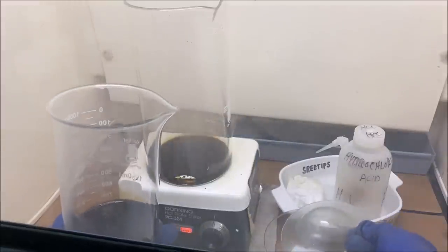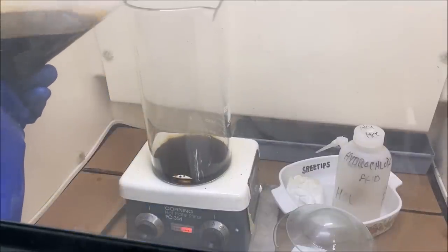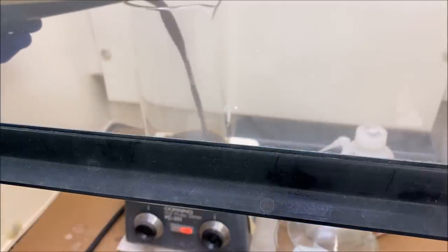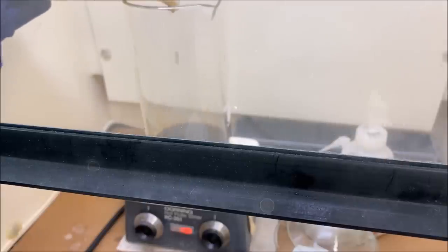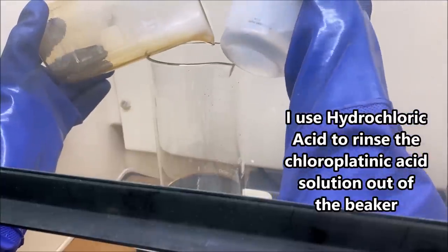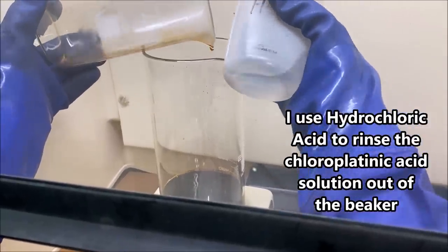What I'm gonna do, this is the platinum solution that I've been pouring off to get it out of the way so I can add fresh reagents to the metal. I'm pouring this back into the main beaker now. The fume hood sash out of the way there. I'm pouring the platinum that I poured off back into the main beaker so that we can allow this to boil and reduce so that we can evaporate off and get a highly concentrated solution to drive off any excess nitric acid that might be in here.